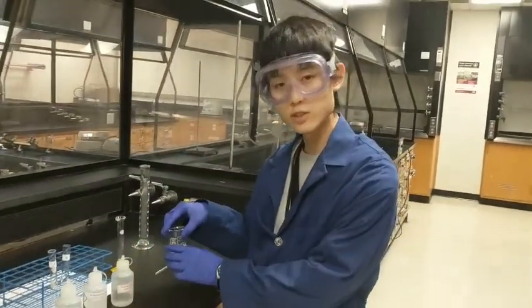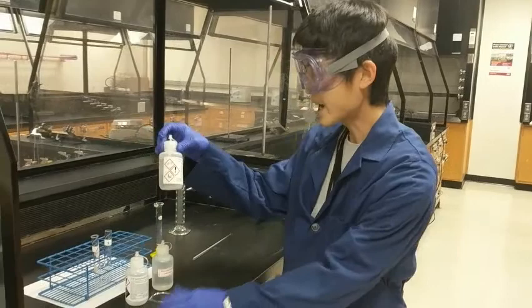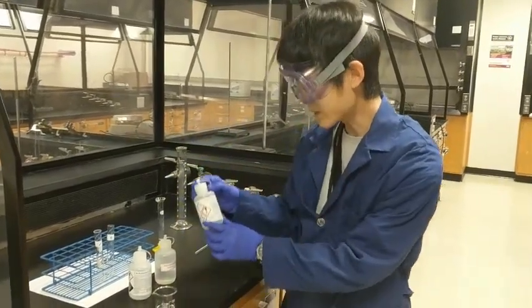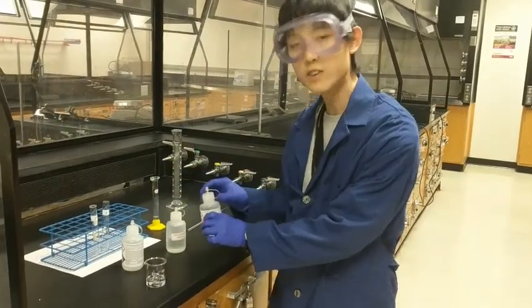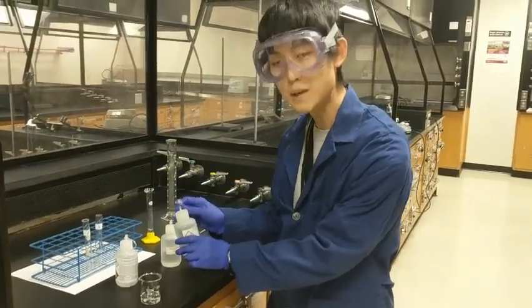What we are going to do first is add 2 drops of ammonium hydroxide solution and 2 drops of phenolphthalein indicator to the beaker.